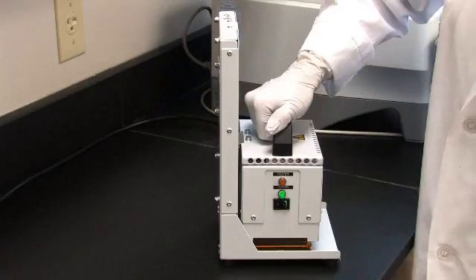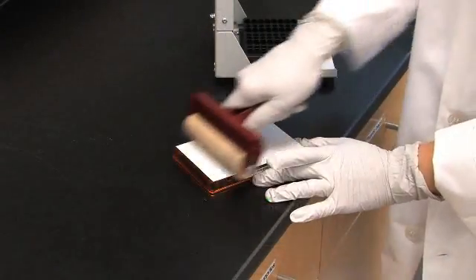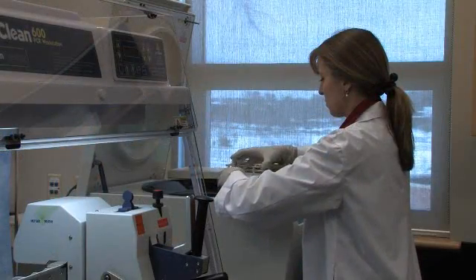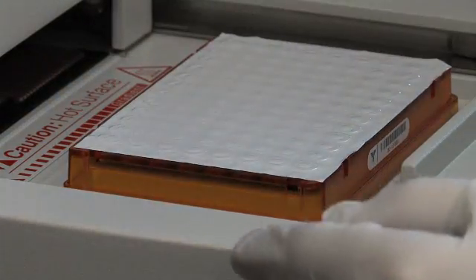After centrifugation, the PCR plate is sealed again using a heat sealer to prevent evaporation during PCR. The plate is spun again for one minute at 1000 G, then placed in a thermocycler for DNA amplification. This concludes the PCR step.